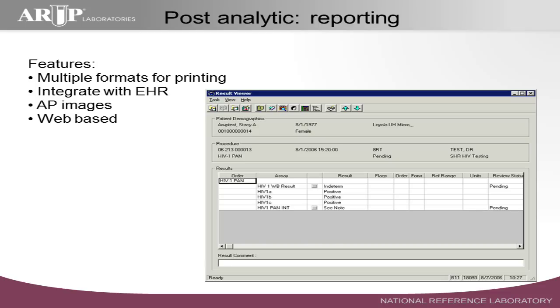Okay, moving on to the post-analytics side. So if all of you are med techs and you've done your analysis, you've wrapped things up, do you have to be concerned about printing those reports out and faxing those to the doctor? No, not for the most part. That's done by the LISs and other systems today. So we talked about that integration, and that's where that comes in.